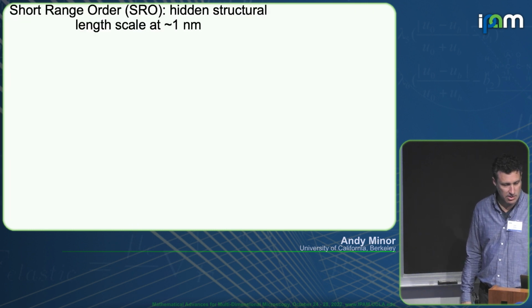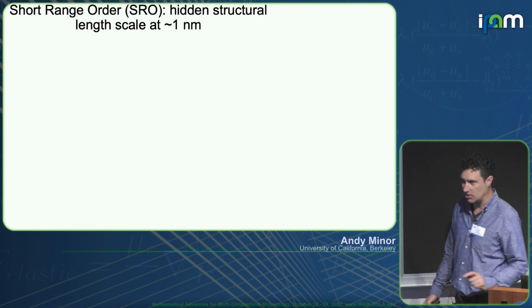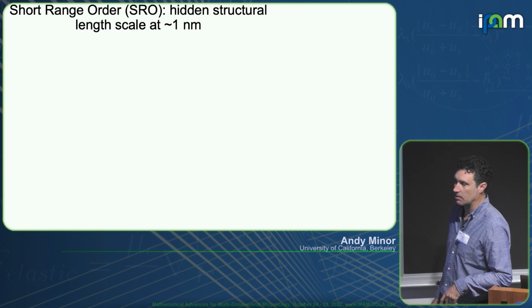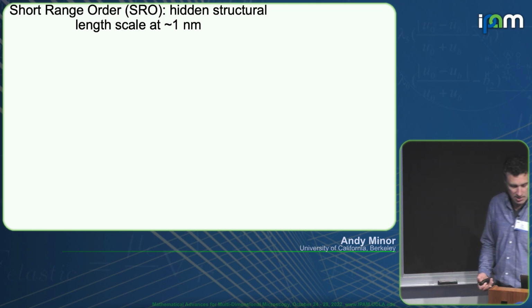So, okay, I want to now turn to one last topic, which is short range order in metals, and talk about how 4D STEM is useful in looking at microstructure there.